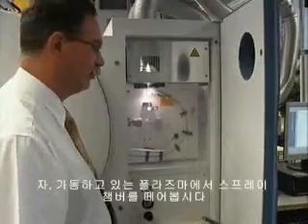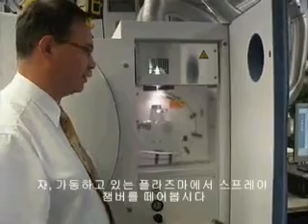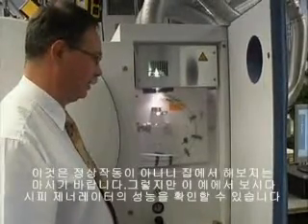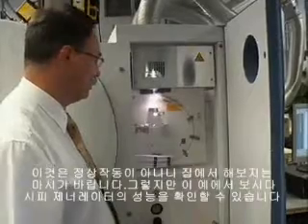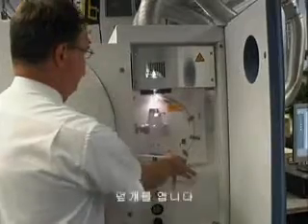Okay, as discussed before, as a simulation of a quite drastic load change, we're going to disconnect the spray chamber from the running plasma, and that's not a normal situation, so don't do that at home, but nevertheless it shows the adaptability of the generator. We're nebulizing DI water here, so no imminent danger.